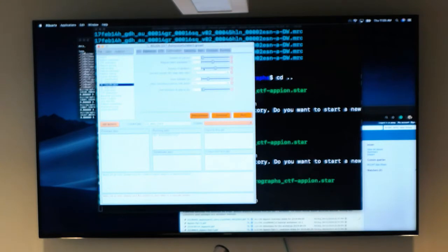Something that we are not providing with this environment is a nice visual display. We don't have Chimera installed, so a lot of the 3D visual display is left to be desired. For example, in your tutorial, you'll see that if you want to see a 3D output, it's 2D slices of a 3D projection. But I try to show you in a couple places what it would look like if you ran ab initio or initial model.